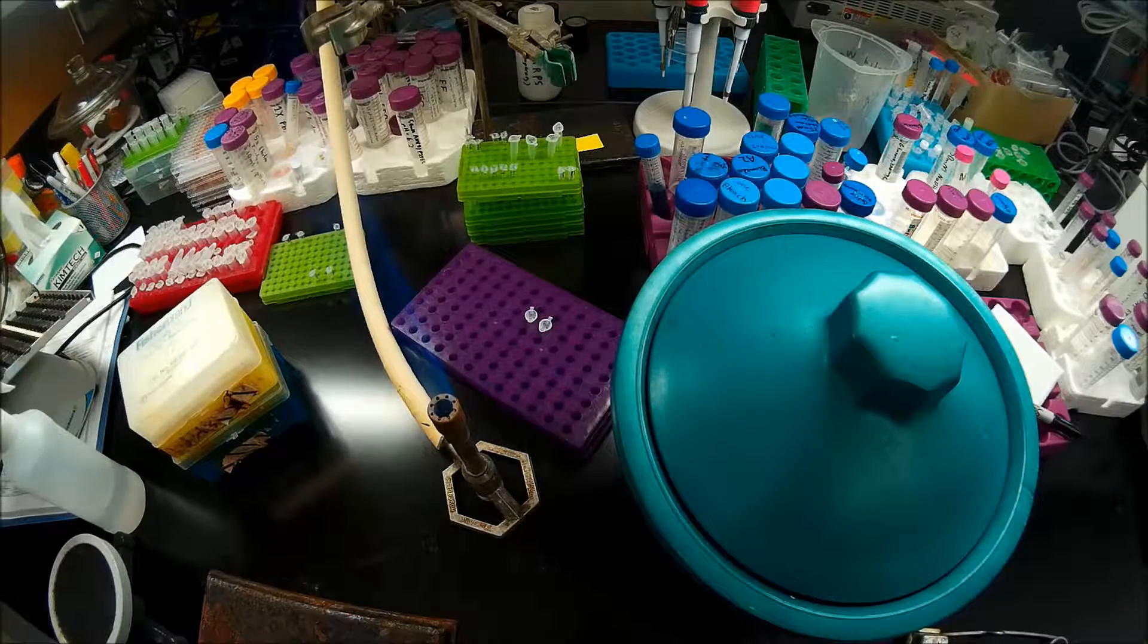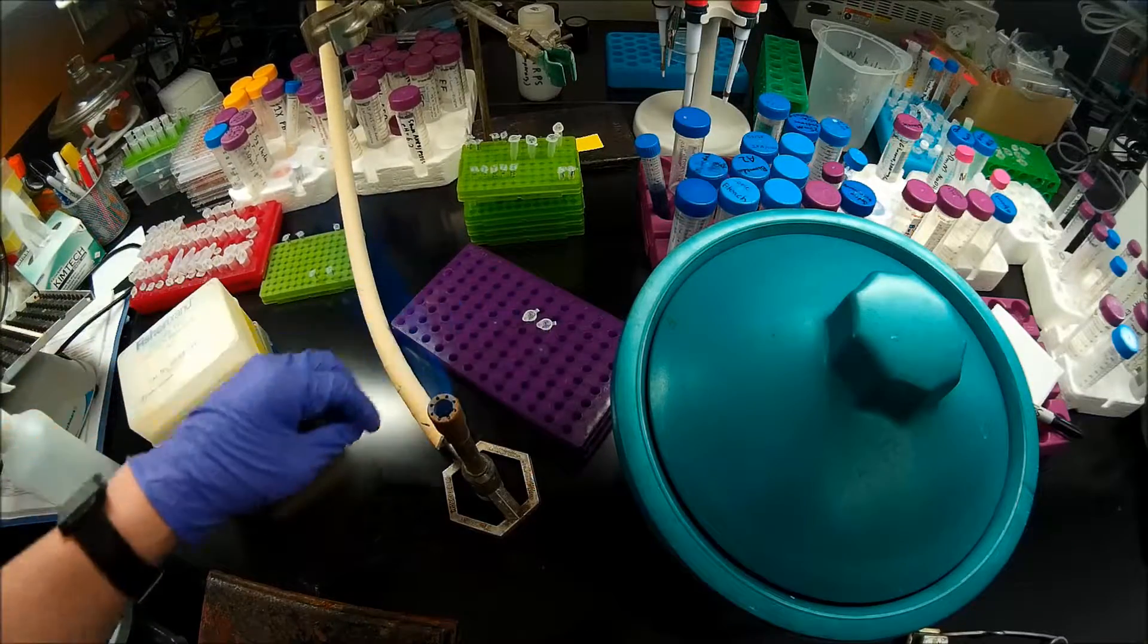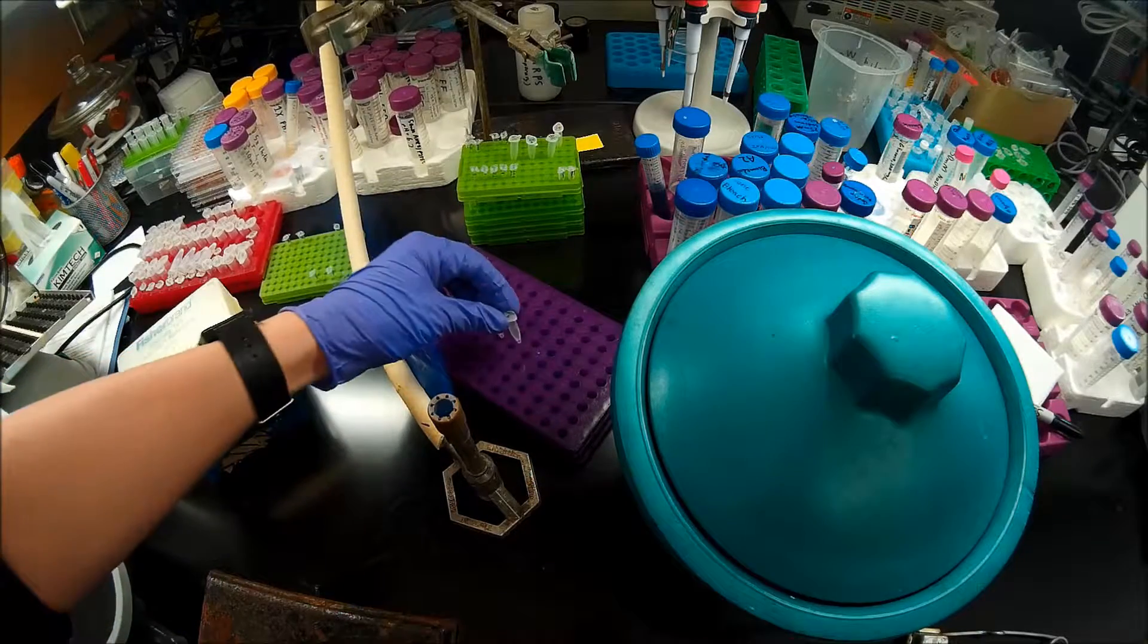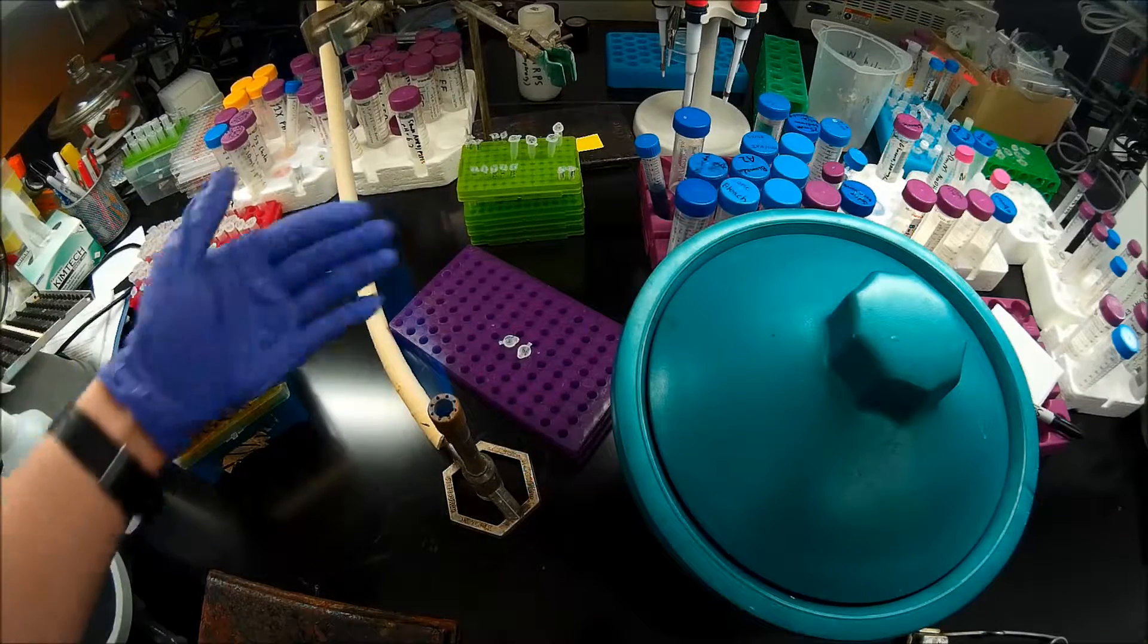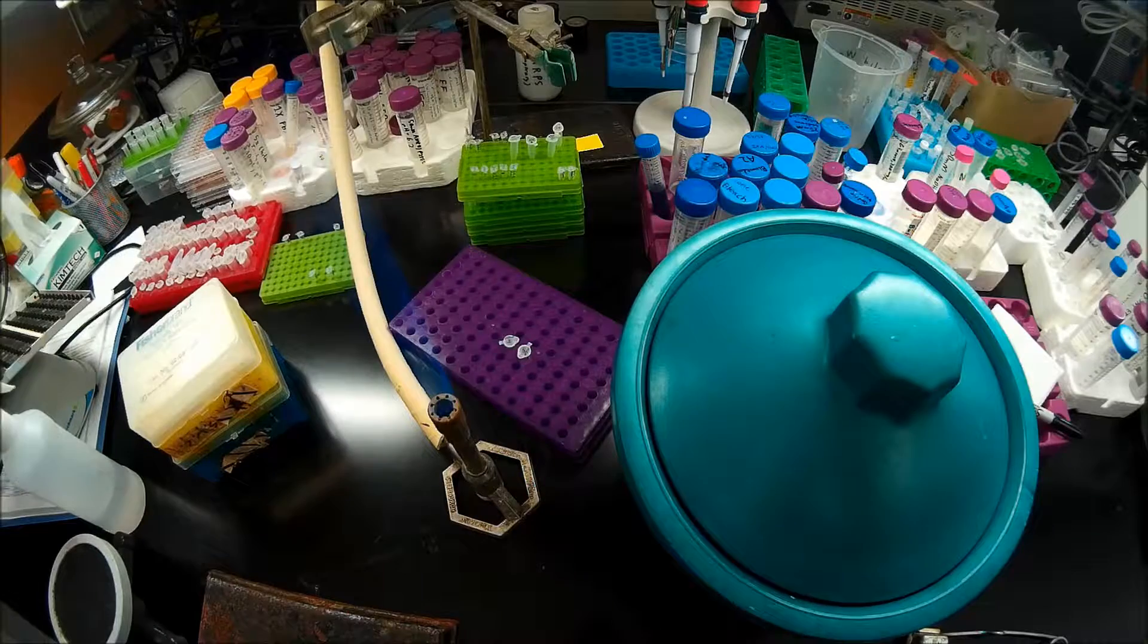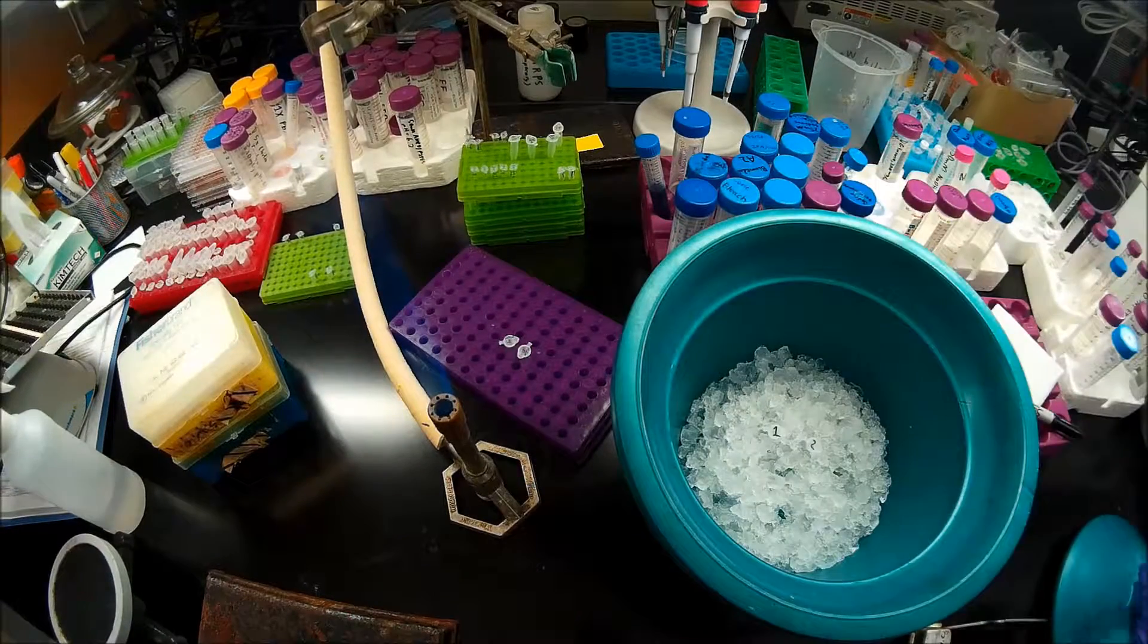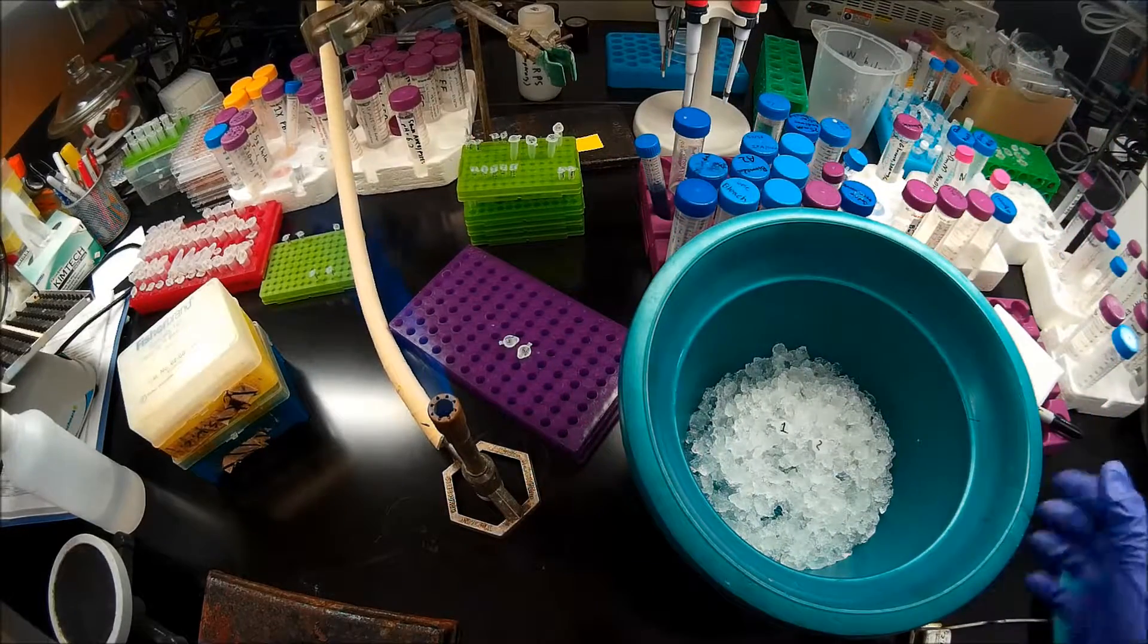After allowing my competent cell aliquots to thaw for about 10 minutes, I want to add DNA to them. These are ligation mixtures, but the procedure would basically be the same if you were adding whole plasmid. You'll note that I am working under a flame here. I'm trying to maintain aseptic technique. So I have my two aliquots of competent cells there.